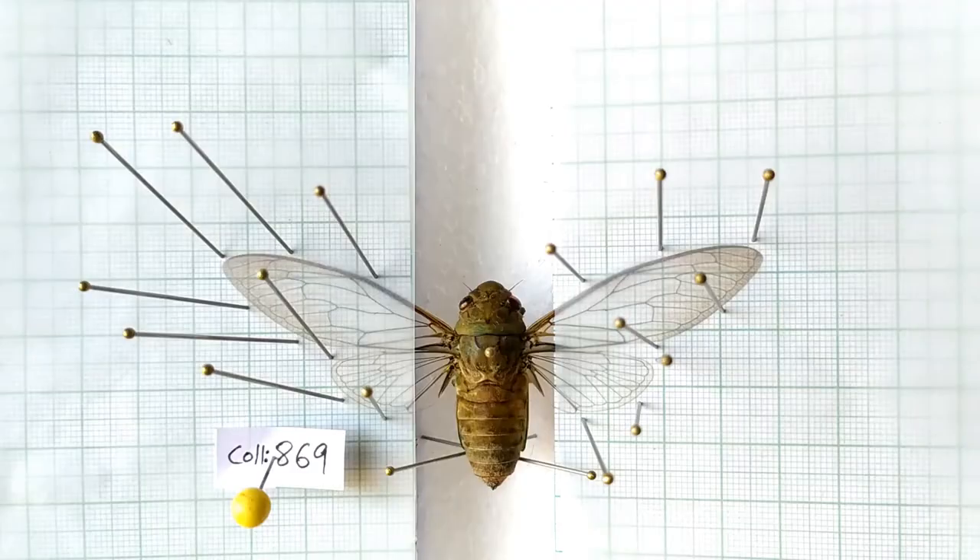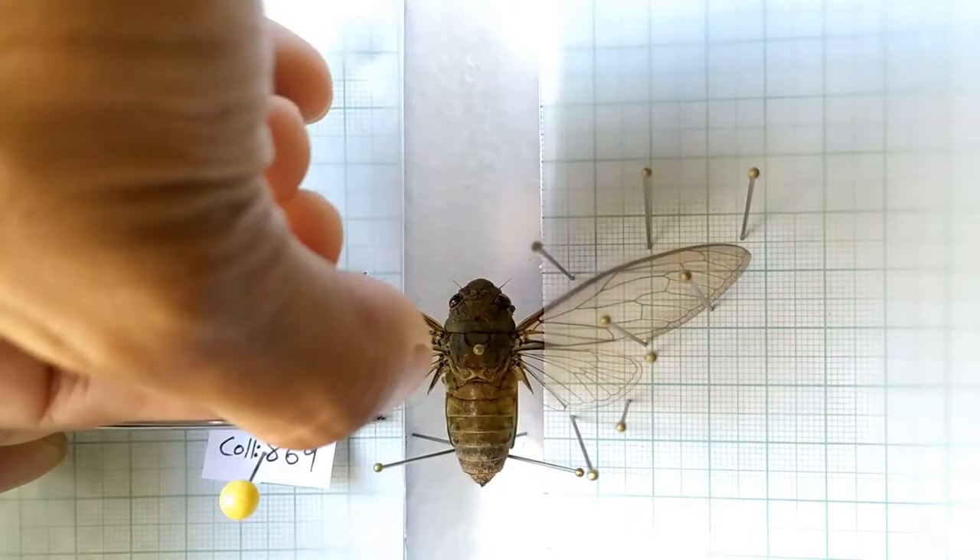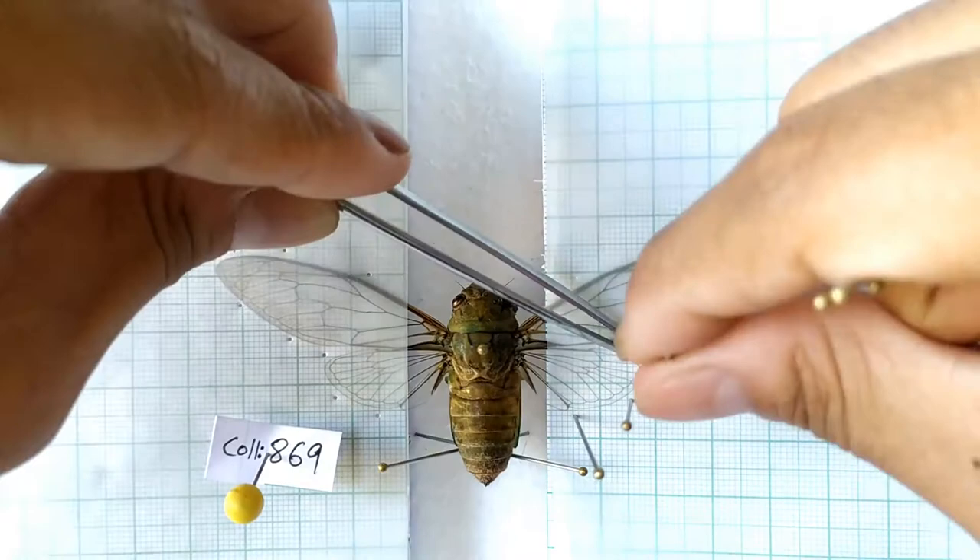Once the specimen has dried, carefully remove the pins used to secure the wings and abdomen. Remove the butter paper sheets from the wings.